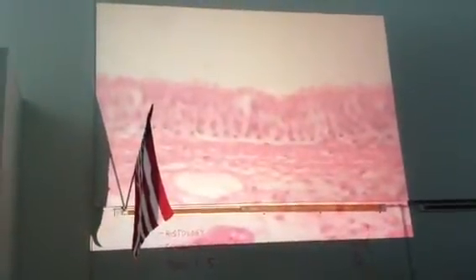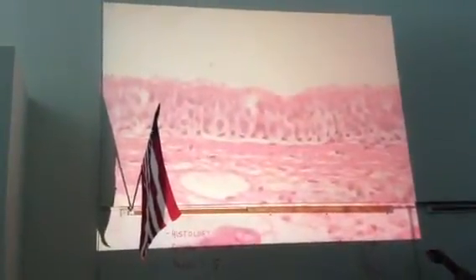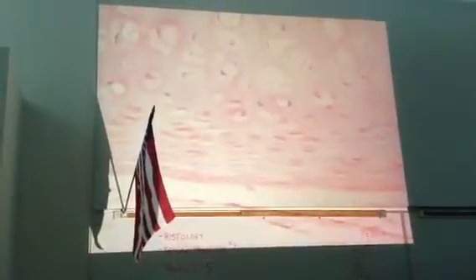Okay, so there's a pseudostratified ciliated columnar epithelium. The lumen of the trachea is up above. And a little bit of fat down here, some connective tissue, mucin-secreting glands, and we come down and hyaline cartilage right there. And the perichondrium, you can see on the far side, much clearer than on the inner side, right there. Now, I'll go to lower power, and we'll sweep back up, and we'll go find that trachealis muscle.